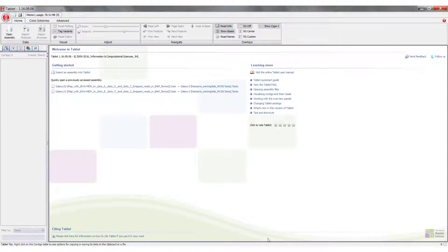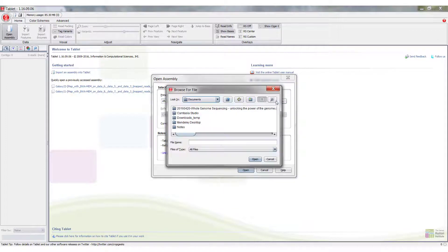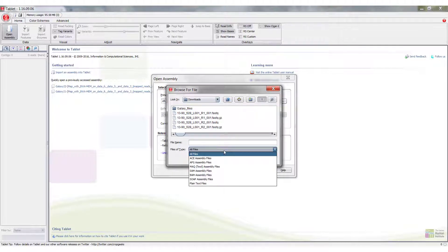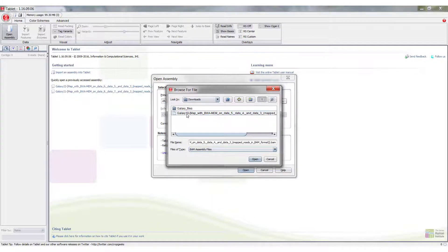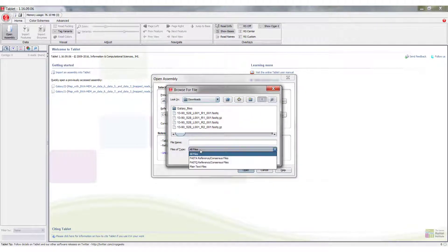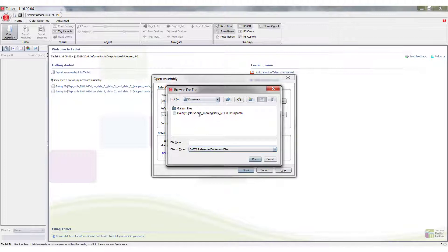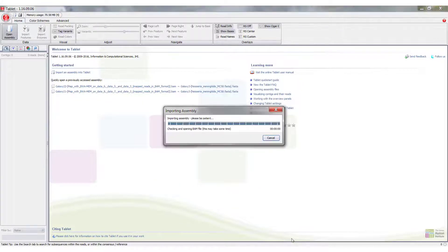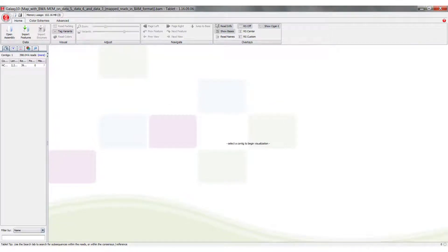With all files downloaded, we can open Tablet. To visualize our mapped reads, we go to the top left and click on Open Assembly, then click Browse. This is our primary assembly file — we go to the folder where we saved everything (Downloads), select BAM assembly files, making sure to always pick the BAM file and not the BAI file. We then browse for the FASTA reference, which is the Neisseria meningitidis FASTA file, and click Open. It asks us to select a contig to begin visualization, and the mapped reads are in one contig, so we click to open all mapped reads.